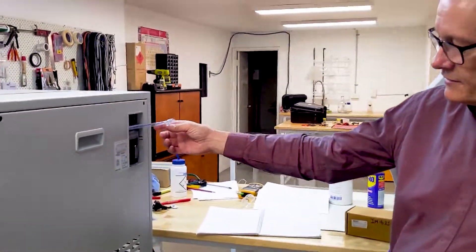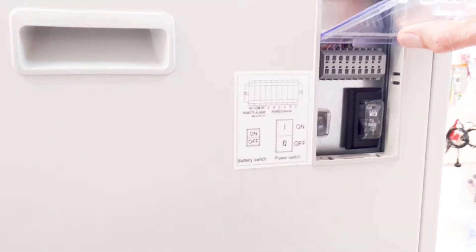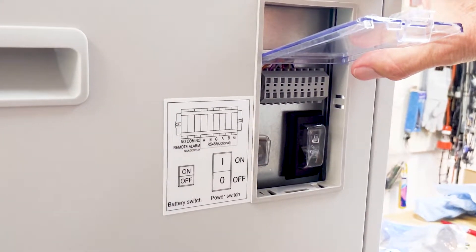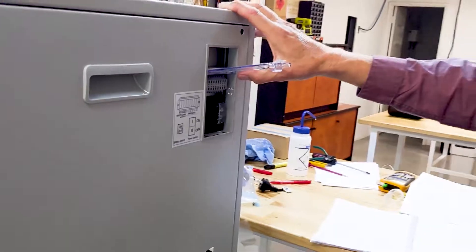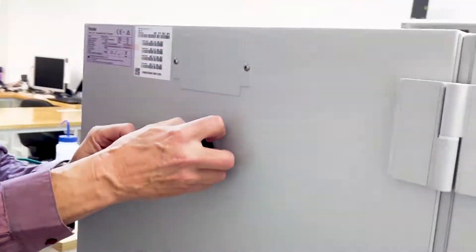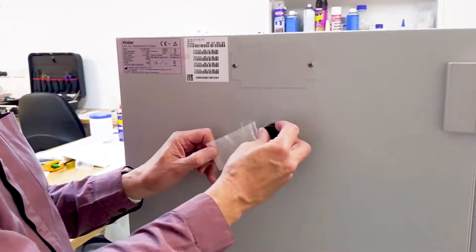The facility to have the system remotely monitored is also available here, where your laboratory monitoring system can be connected into a simple relay switch built behind these connectors. That way, if the alarm occurs in the middle of the night and no one's in the lab, it will send a signal to your remote monitoring system to advise you that something is wrong. In this particular model it won't tell you what the fault is — you still have to look at the front of the freezer. On other models within the Haier range it's possible to send actual data specifying the fault. There is also an access port on this side with a plug, so you can put your own internal probes through for any independent monitoring you might want.